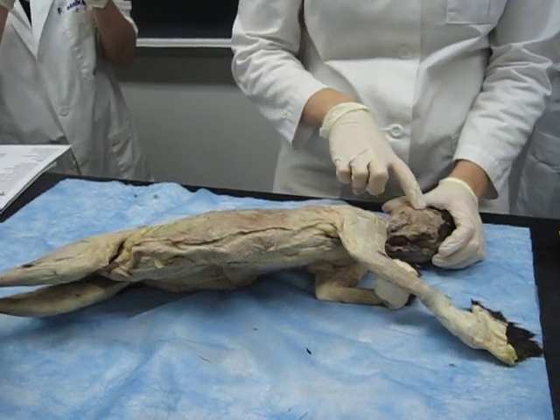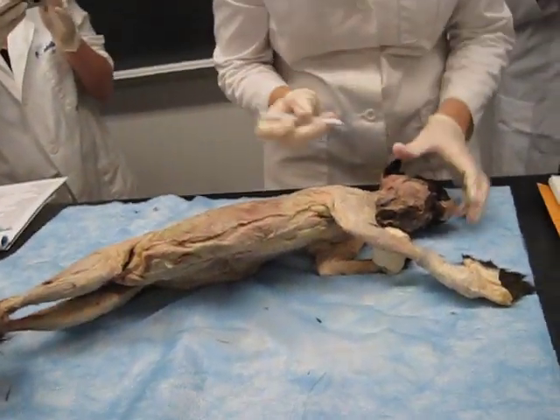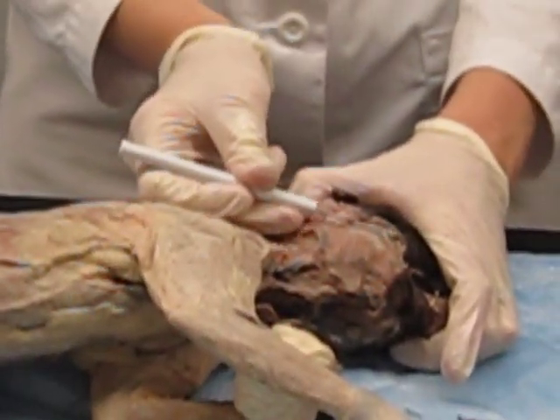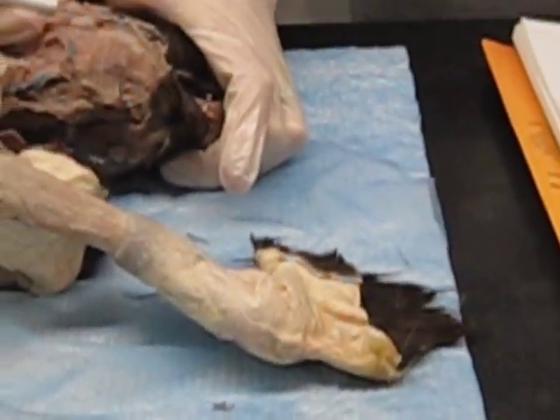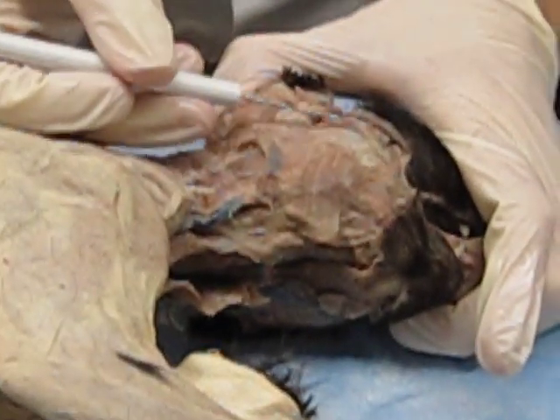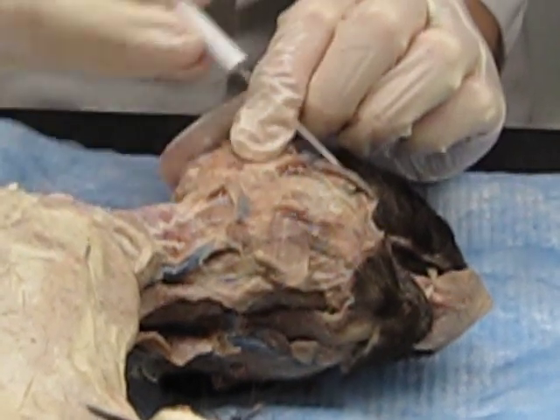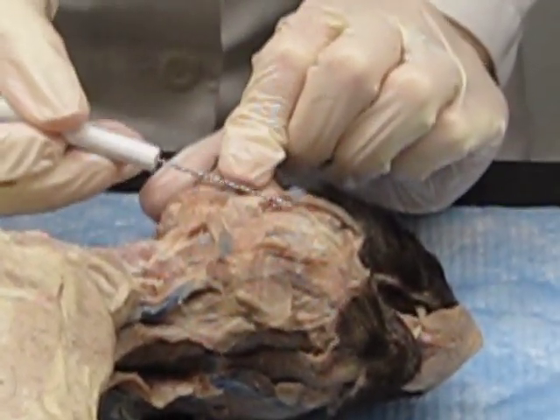To get through all of this to reveal the underlying structures. So already I can kind of see this string-like structure. Do you see that? That's the facial vein. Facial vein. Literally, this is the third time I've done this. I'm tired. Facial nerve, okay? My parotid salivary duct is actually right here. So you're looking for linear structures.